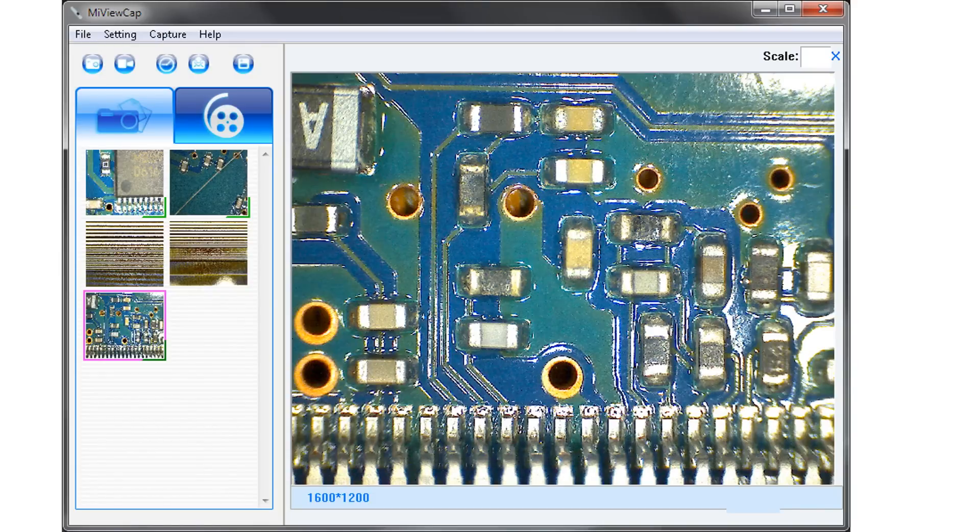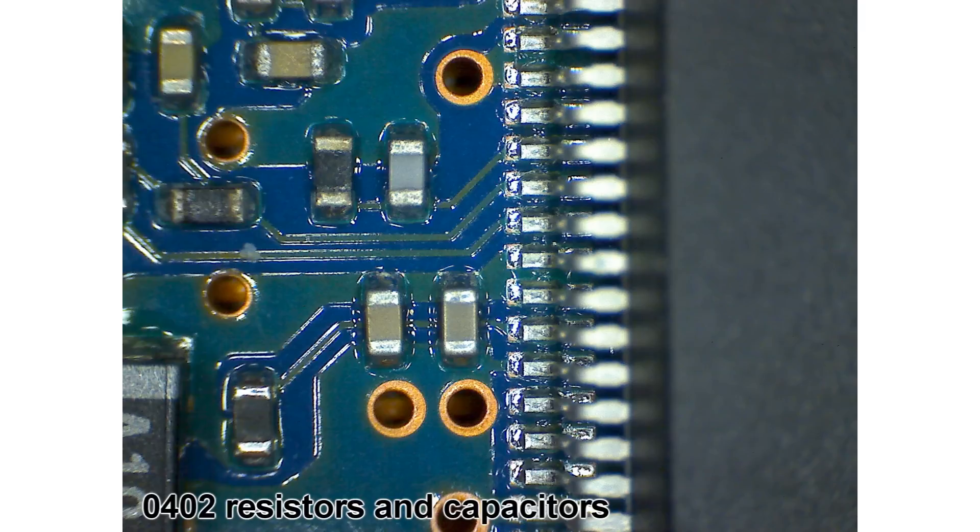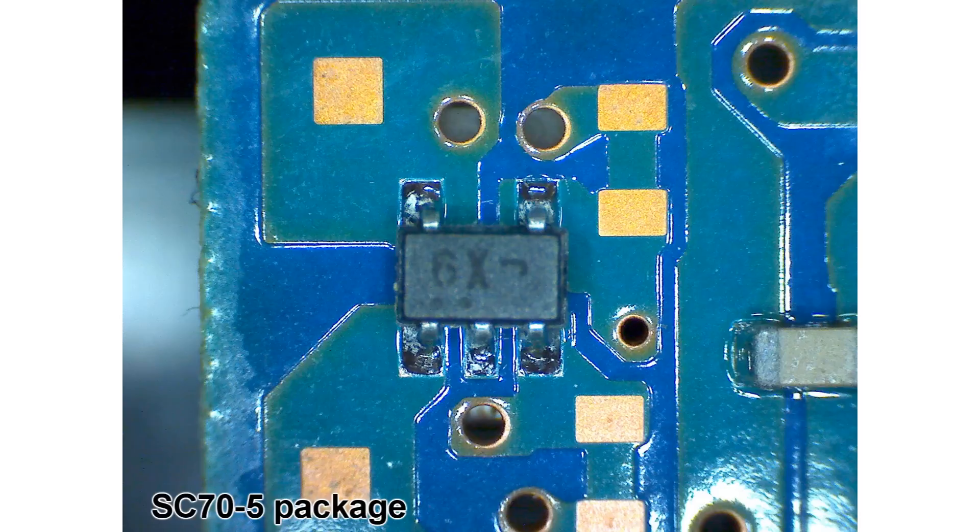Let's look at some pictures. The software and drivers installed just fine on 64-bit Windows 7. I was very impressed with how sharp the images are. The automatic color and white balance functions seem to work just fine. I also found that you only need a little bit of LED lighting to get a good image. There's some noise, but it doesn't limit the detail captured at all. The product has a really good low light sensor.